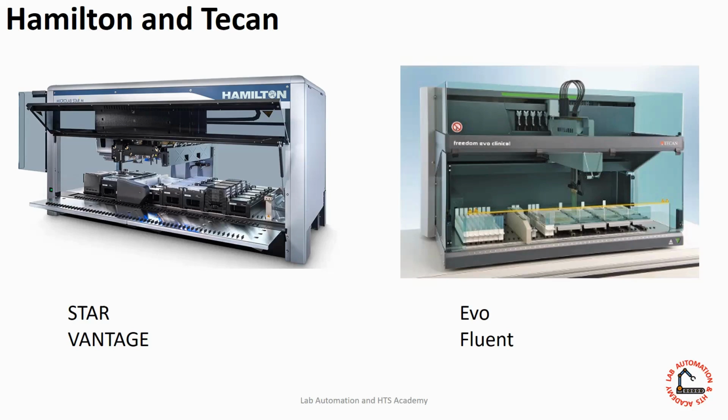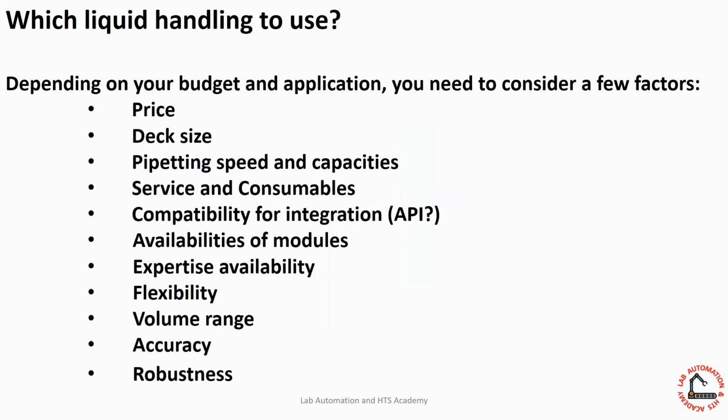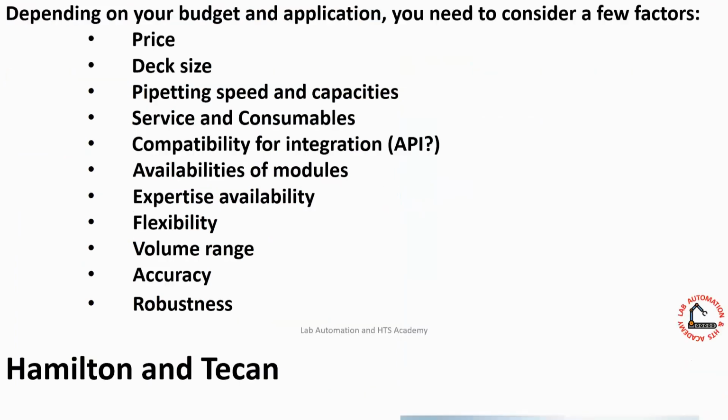But as I mentioned, there are hundreds of liquid handling robots that you can find. Just Google liquid handling robots, and you would probably see 100, each with different flexibilities, throughput, speed, and so on. So at the end of the day, remember that you want to answer this question, and all robots are developed to answer one of these needs.